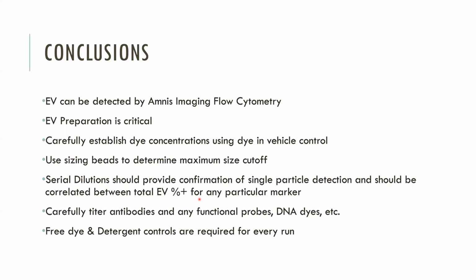You want to carefully establish all the concentrations, including the dye concentration for the lipophilic dye, and you should be doing that with the vehicle control and with a dilution series of the dye itself, and cross-diluting with the EVs so that you can see that you've got consistent intensity. You want to use sizing beads to determine your maximum size cutoff. As I said, the refractive index mismatch means that you can't see any measurement for side scatter below about 100 nanometers.